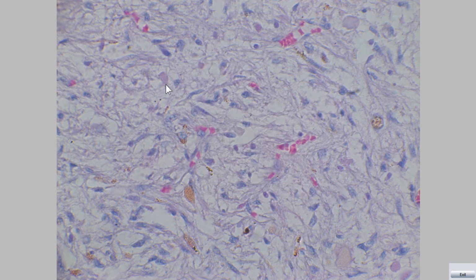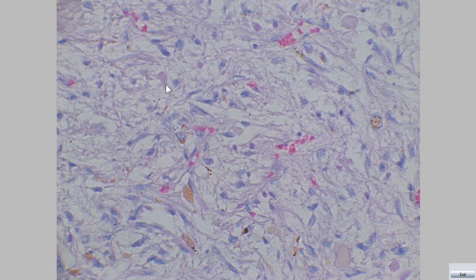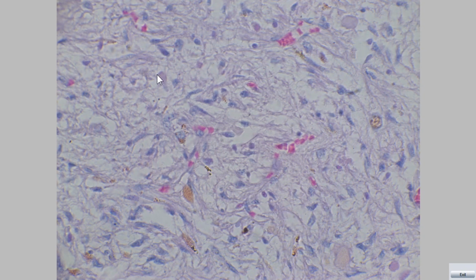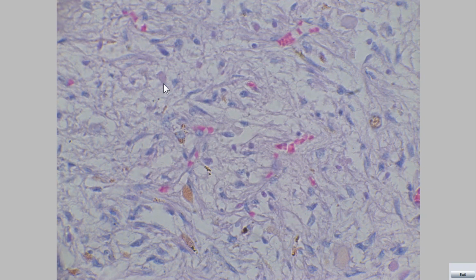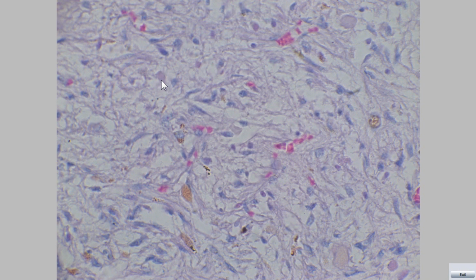Two hormones are synthesized in the hypothalamus, transported axonally into the pars nervosa, and accumulate in an axonal dilation called neurosecretory bodies or Herring bodies. At the tip of the pointer, we can see the Herring body. It is an axonal dilation. The hormones accumulate in this structure. Herring body.